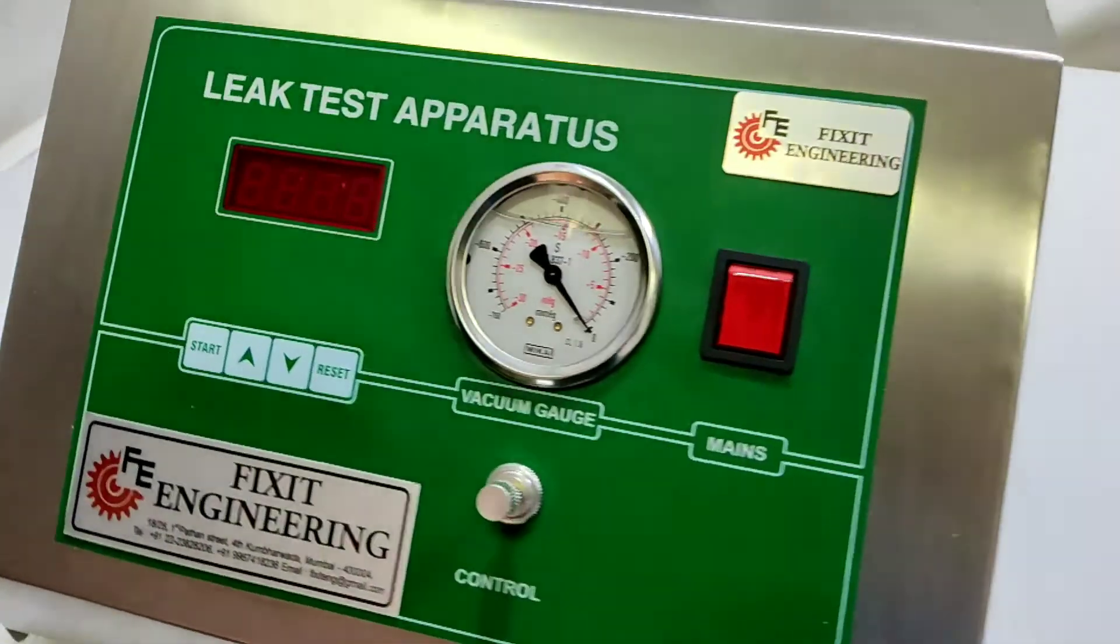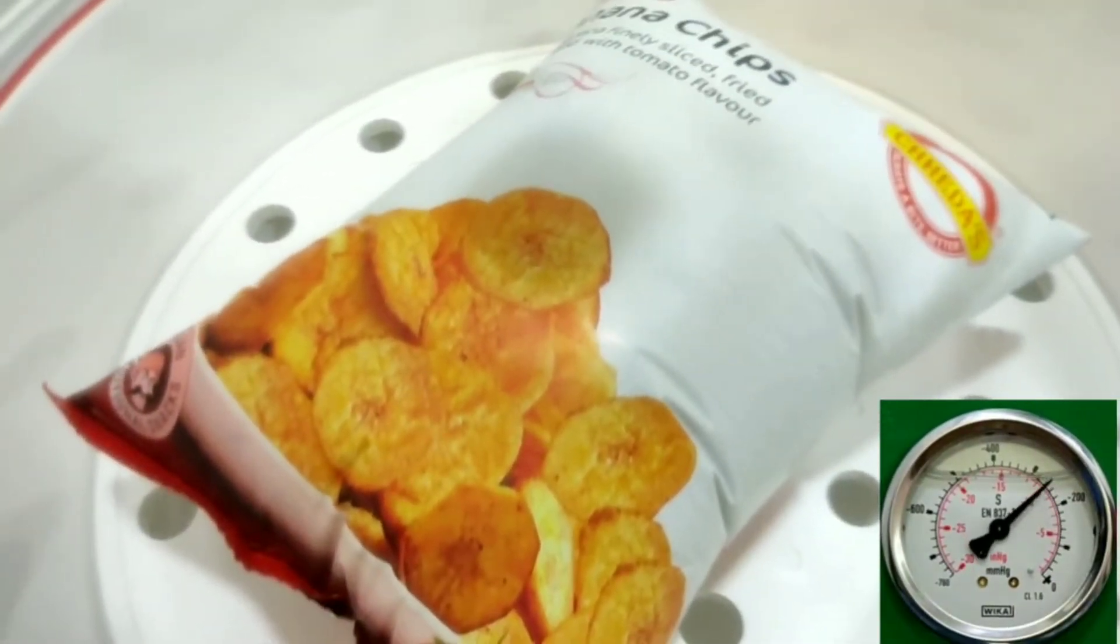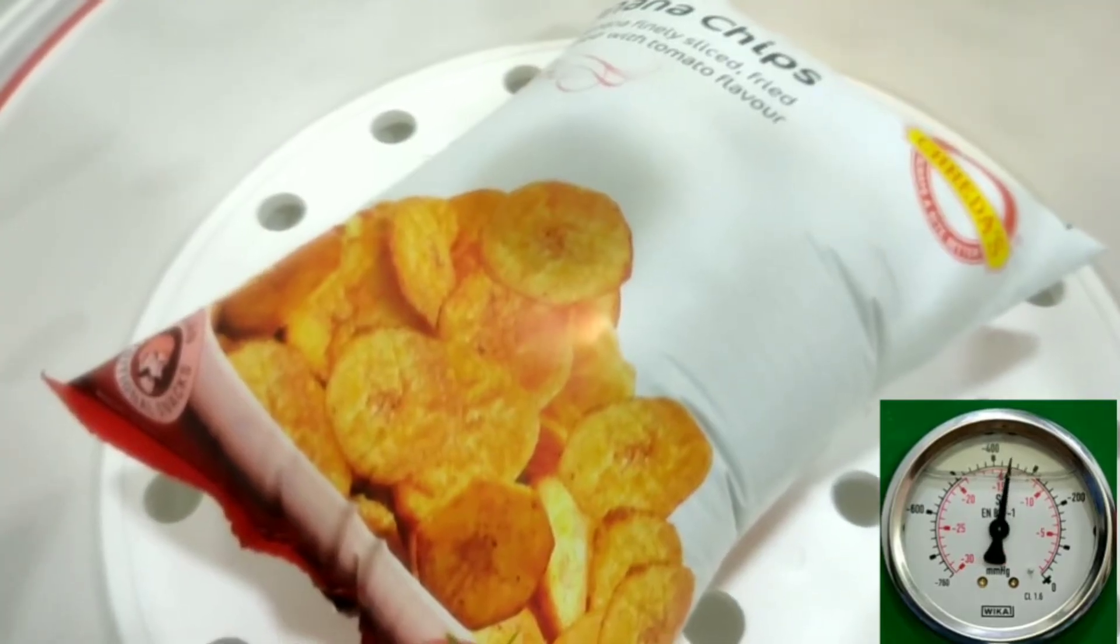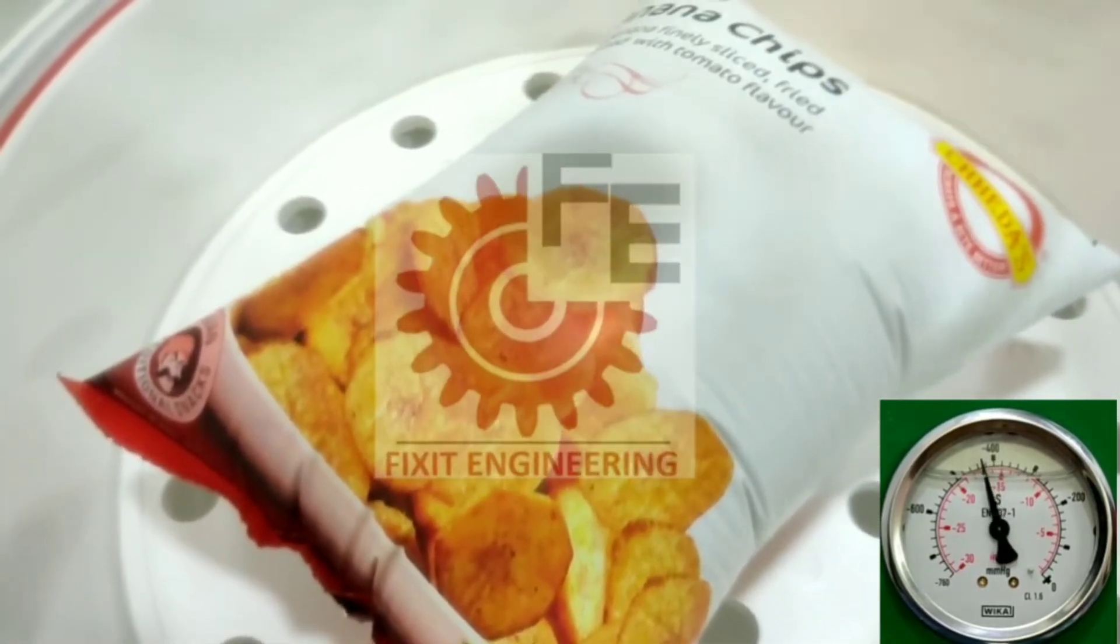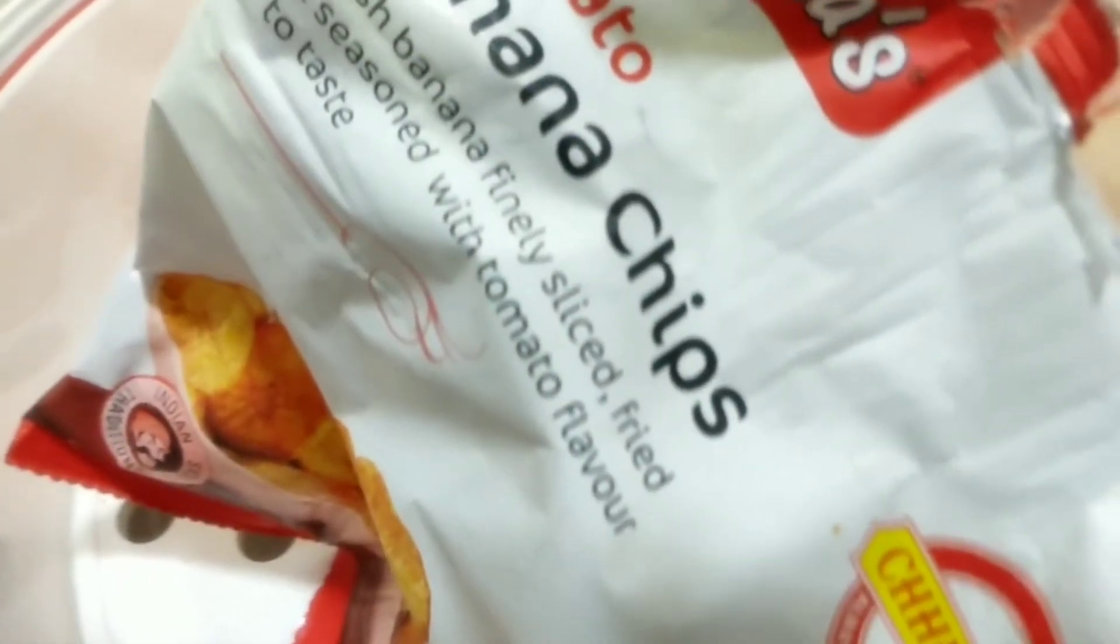Dry tests can also be conducted in the apparatus. Vacuum creates pressure differential between the inside of the specimen and the desiccator air pressure. The difference in pressures grows until the specimen is no longer strong enough to maintain its integrity and it explodes.